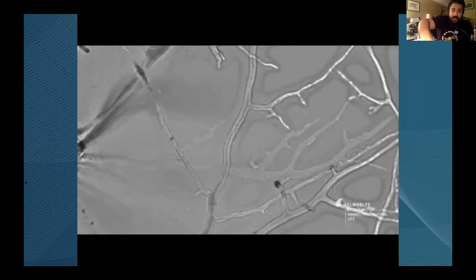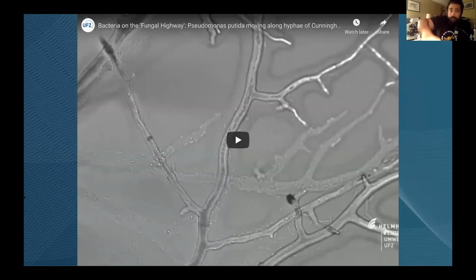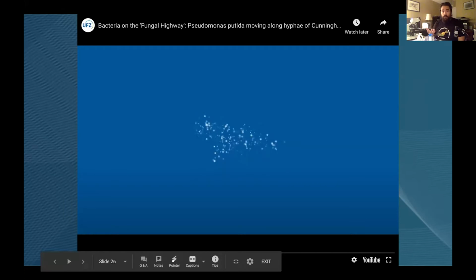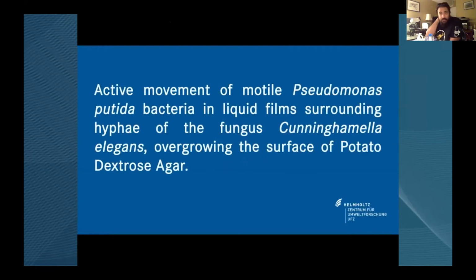And what's really amazing is that even beyond that, we have interchanges of roles that are happening within the actual soil. These fungi are acting as highways for different microbes. So this is pretty amazing. We'll do a quick little video to highlight that.